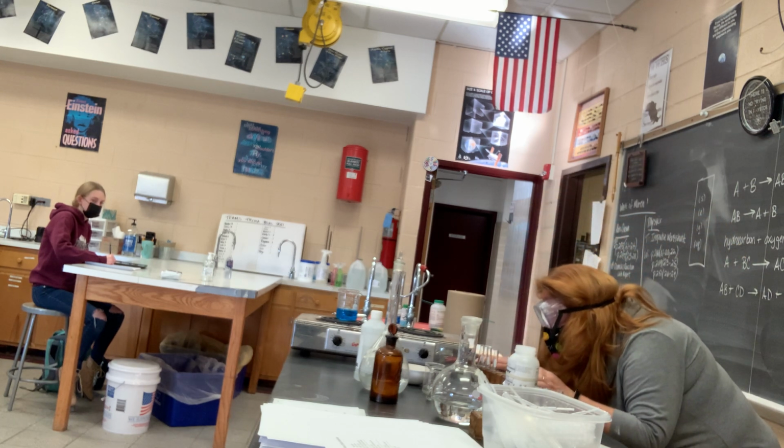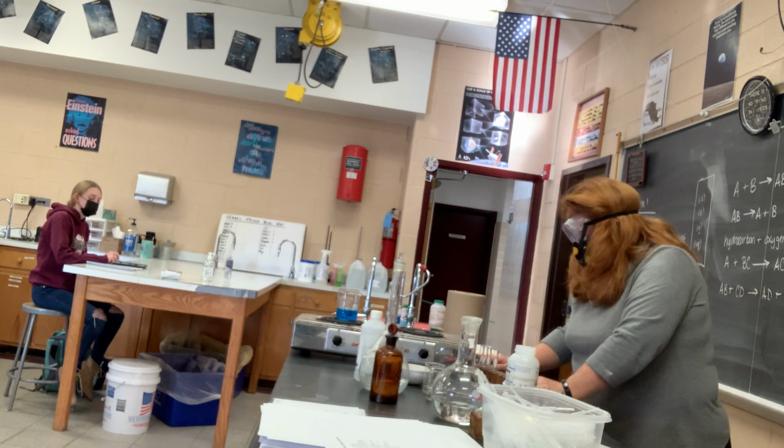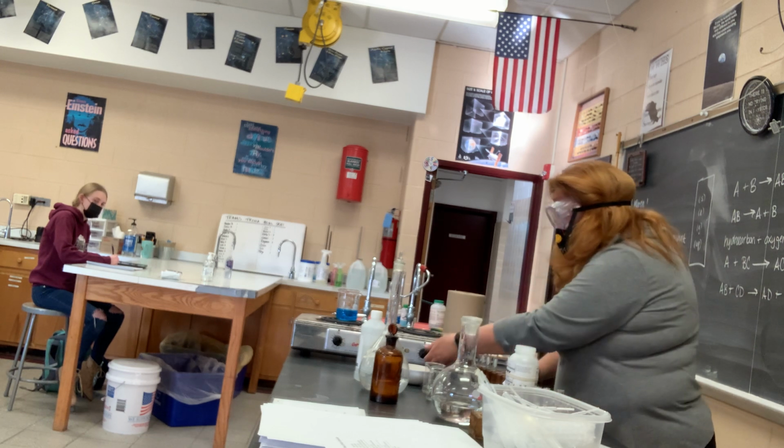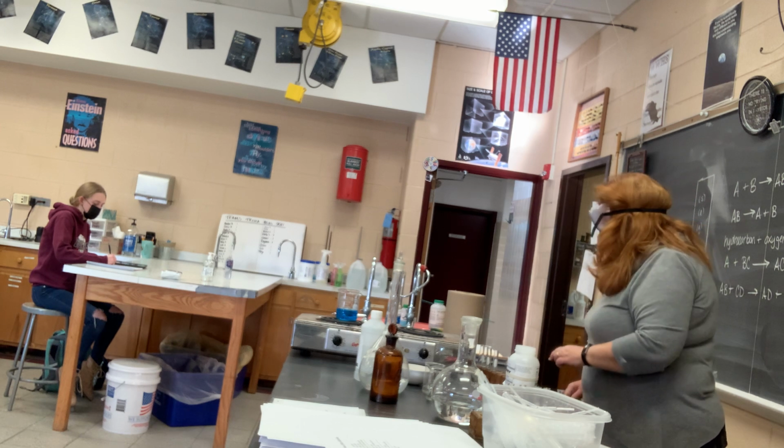So it's going, there's little tiny bubbles. You can see that a gas is given off. It'll sit here for a while and it'll get more fascinating as time goes on. But that's a single replacement.